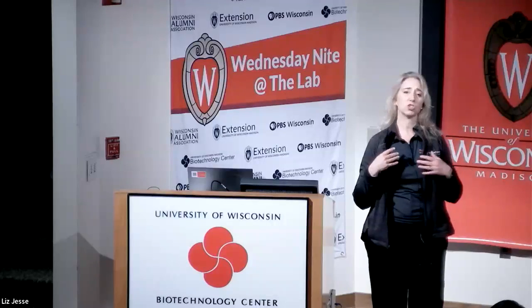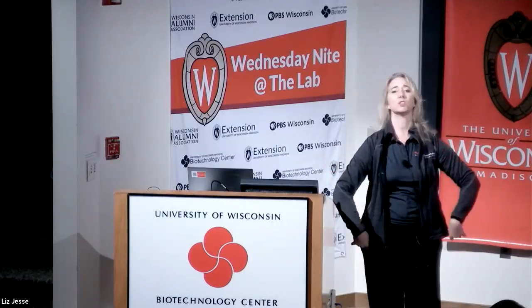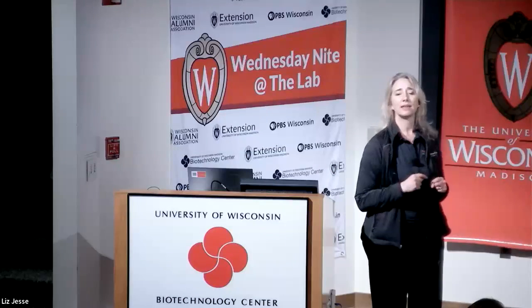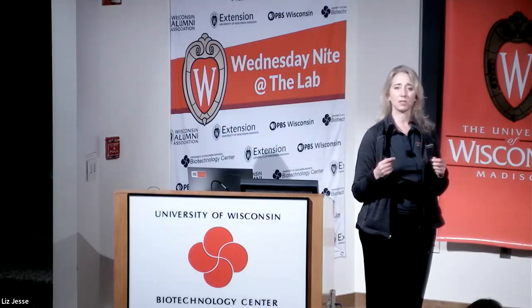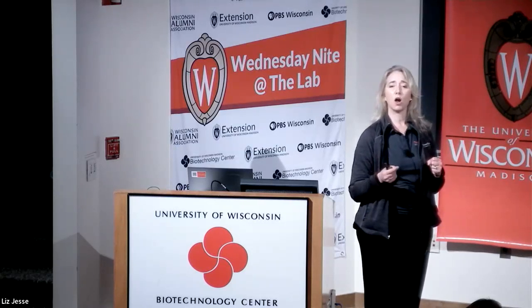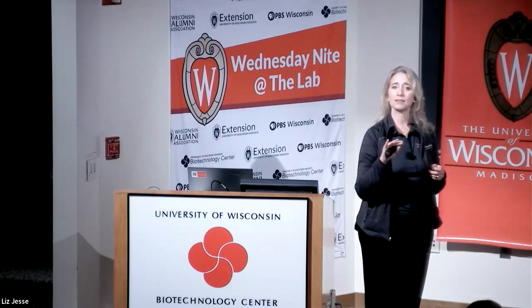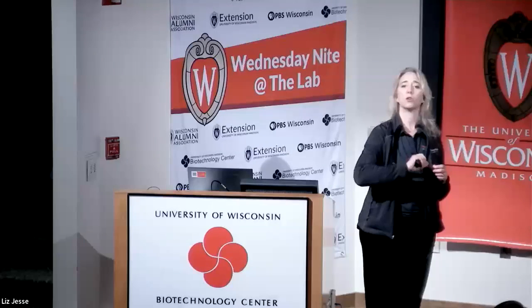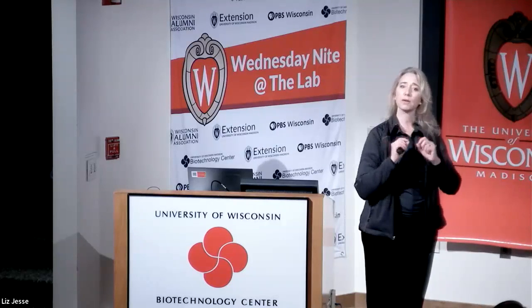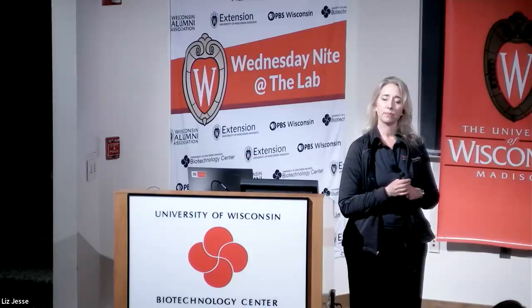We don't worry about that in digital PCR because each molecule is going to have its own sandbox to play in. So we give it as many toys as we want. That's the reason that multiplexing works so efficiently: we don't have to worry about the competition in that scenario. But we're also not as concerned about any decrease in efficiency of the assay, because we just want to see the endpoint. We don't care if it's a little bit slower or a little bit higher than another one, because it's the endpoint that we're measuring in that scenario.